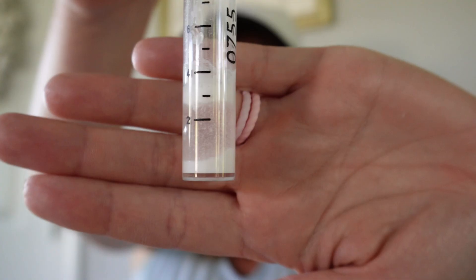I have finished all of our soil samples — it's pretty interesting. We're definitely going to need to add a lot of fertilizer and compost. We're trying to do things organically, so the fertilizer we'll be adding will be organic and mostly just compost. Most of our nitrogen was incredibly low. This tube is supposed to be pink if it has high amounts of nitrogen, and as you can see there's almost no pink at all. Pretty much no nitrogen in most of our soil samples. We did have a little bit in one of the pastures where they had horses, but oddly enough in other pastures where they had horses there was none or almost none. Definitely going to have to remedy that.